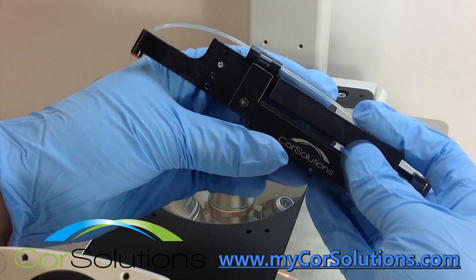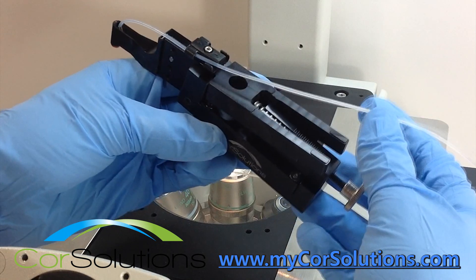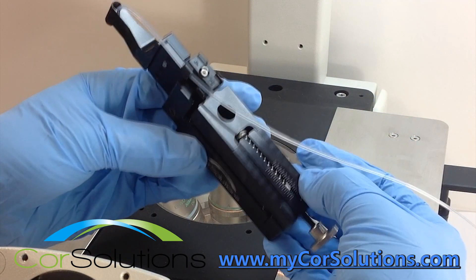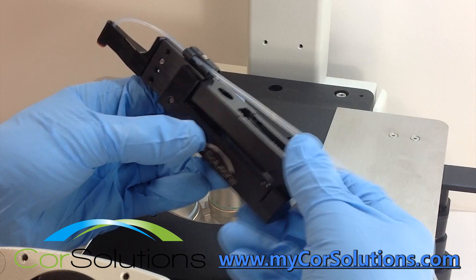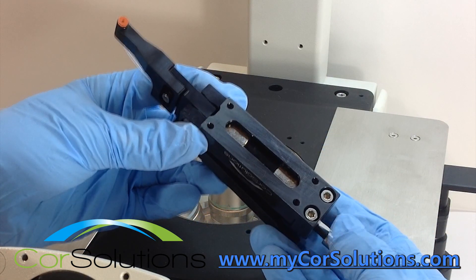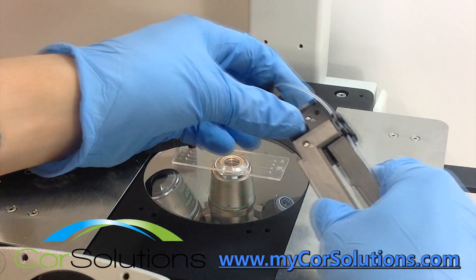The Core Solutions Microfluidic Probe is a versatile and leak-free alternative to permanently gluing connectors to microfluidic chips or custom machining specialty jigs and clamps. The unique patented technology allows for non-permanent leak-tight connections with easy adjustment and alignment of tubing to the device ports. The probe is device-independent and allows for low dead-volume interfacing to virtually any microfluidic chip substrate material.